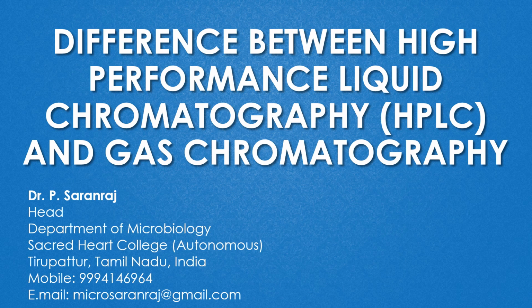Dear viewers, greetings. In this video, we are going to see the difference between high performance liquid chromatography or HPLC and gas chromatography.